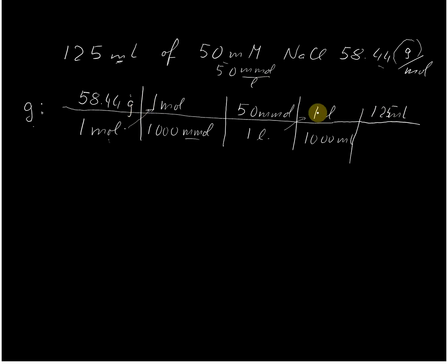So, and we are more or less at an end. So what can we do? So we've got our gram here. Now we can cancel out things. We have mole, that cancels out here. We can cancel out the millimole and millimole. We can cancel out the liter and the liter, and we can cancel out the milliliter. So all we have left is really this gram here.